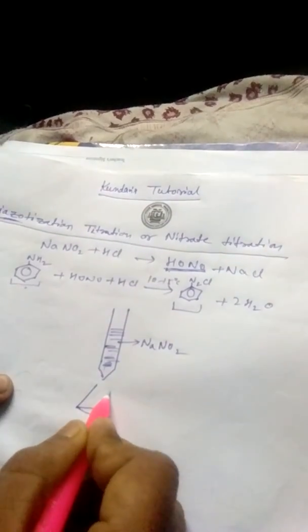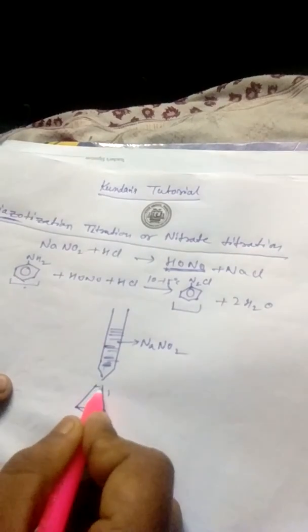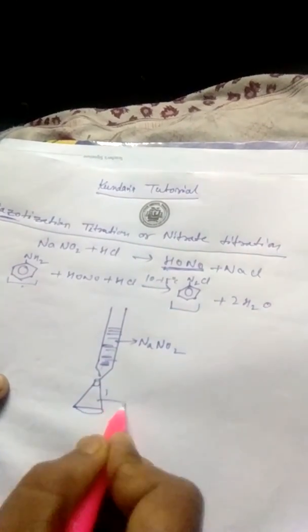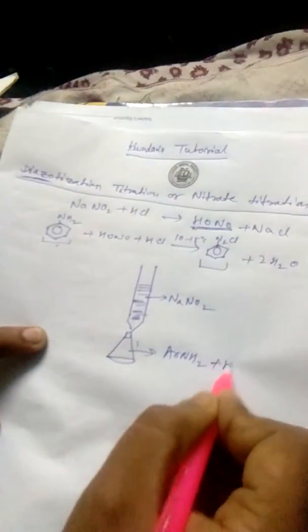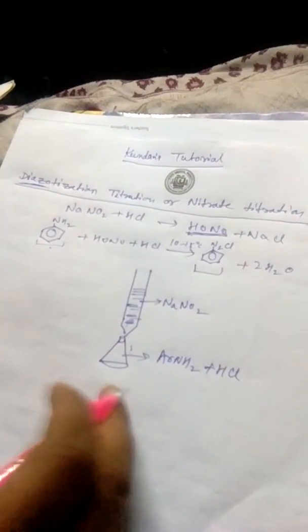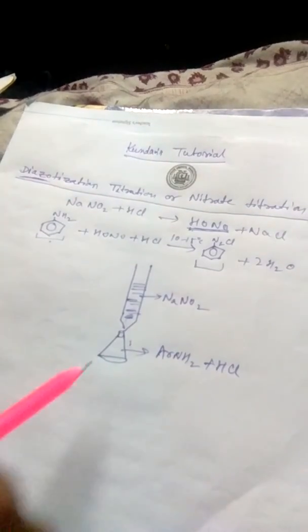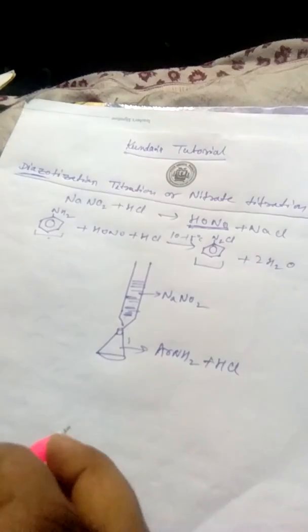This is the conical flask, and this conical flask contains the aromatic amine plus acid, so aromatic amine and HCl.